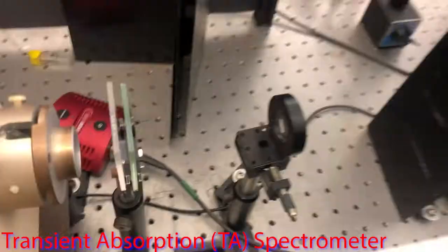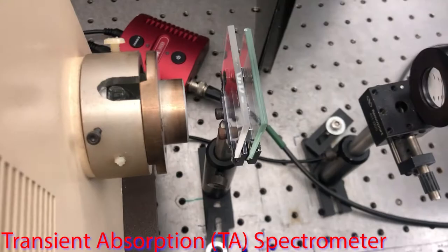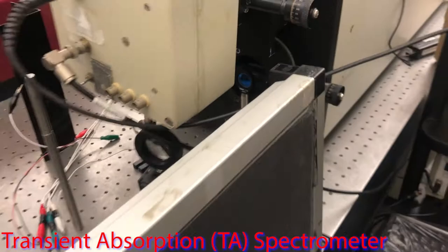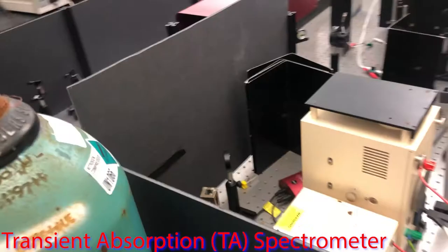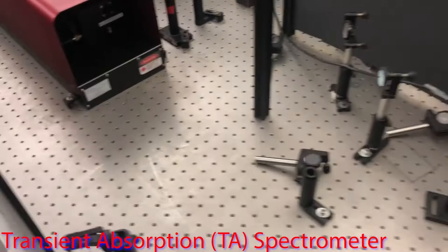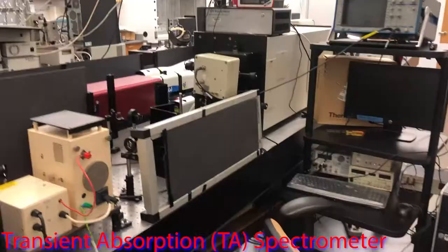This is a standard nanosecond transient absorption apparatus. This allows us to see how species change after light excitation and from time resolution. This also includes spectral modeling and identifying how the states involved evolves over a short time window. This is invaluable for measuring different electron transfer mechanisms induced by light.